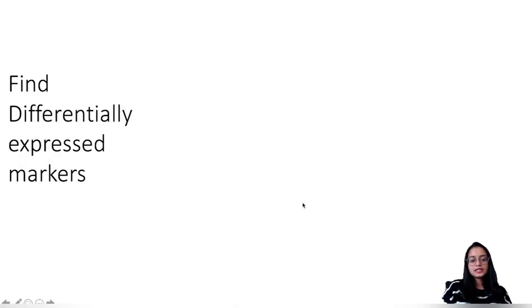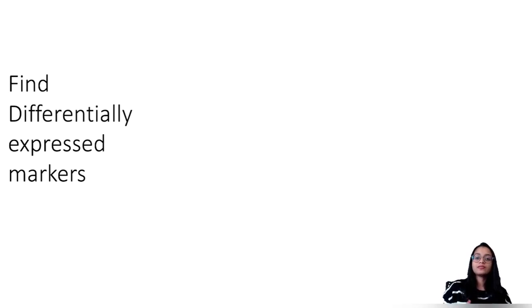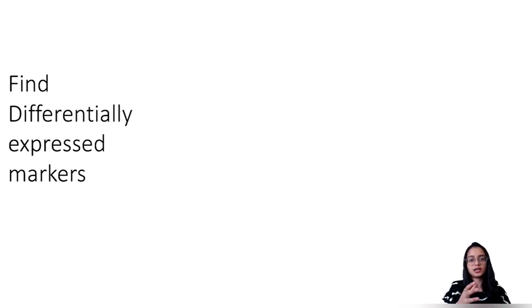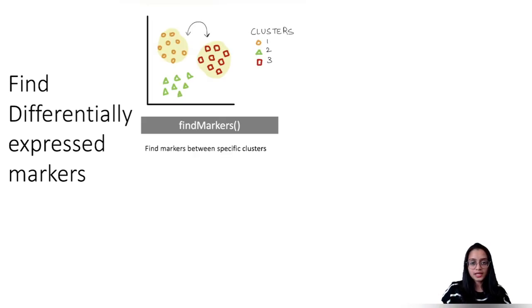So getting straight to the point, let's say you have single cell RNA seq data, you have processed it and ultimately clustered the data so your cells have grouped together into clusters, and from then on you can ask various questions. The first question you might ask is: I have two clusters and I want to compare between them and identify genes differentially expressed in one cluster versus the other. In that case, the FindMarkers function makes the most sense because it allows you to compare between specific clusters — not just one versus one, but one cluster versus a group of clusters as well.